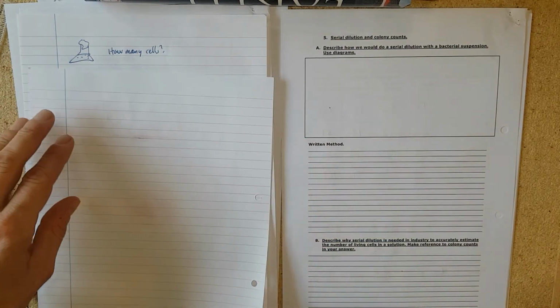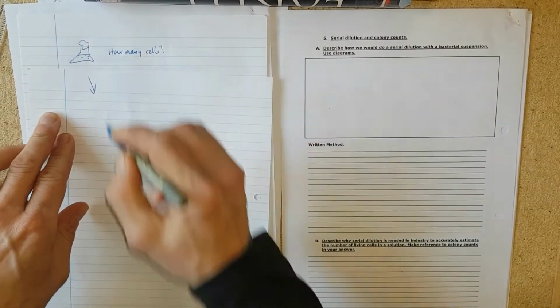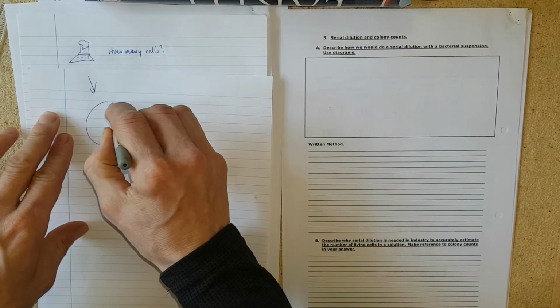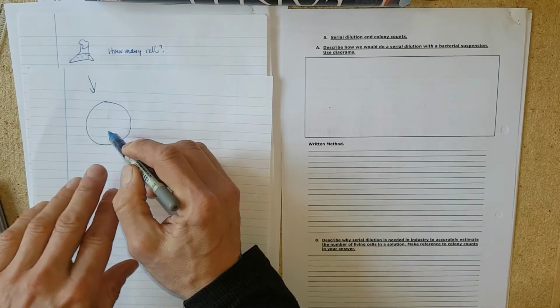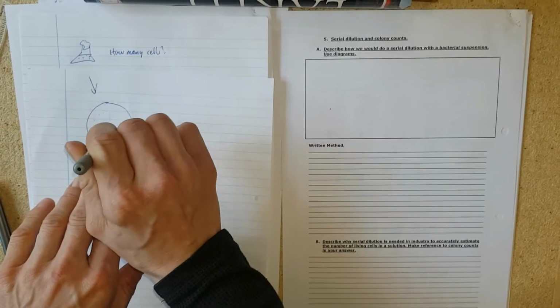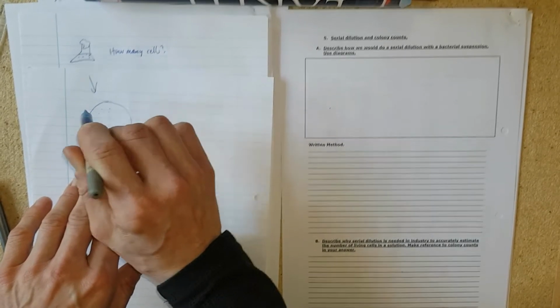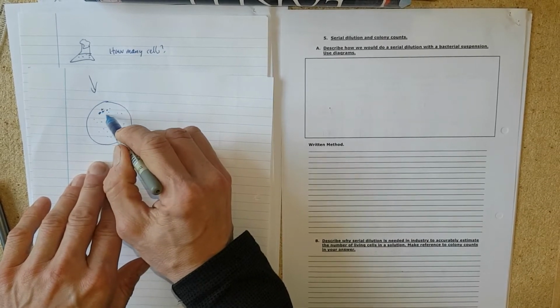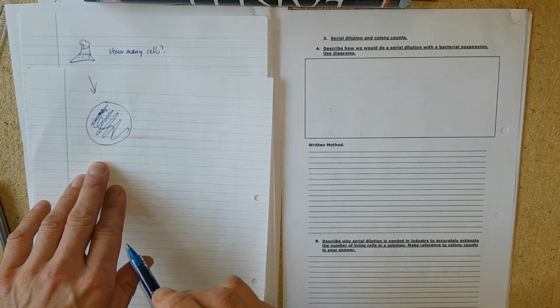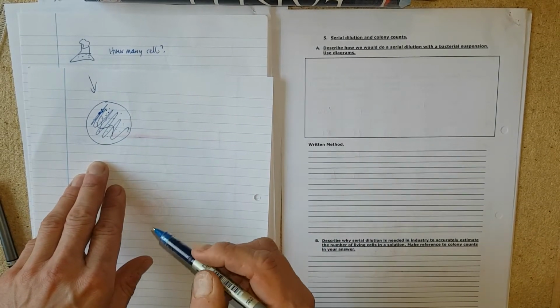If we just took out a sample and put it onto an agar plate, we might get some cells that grow, but after a while each one keeps growing until eventually it just looks like a big mess and you can't count separate colonies.